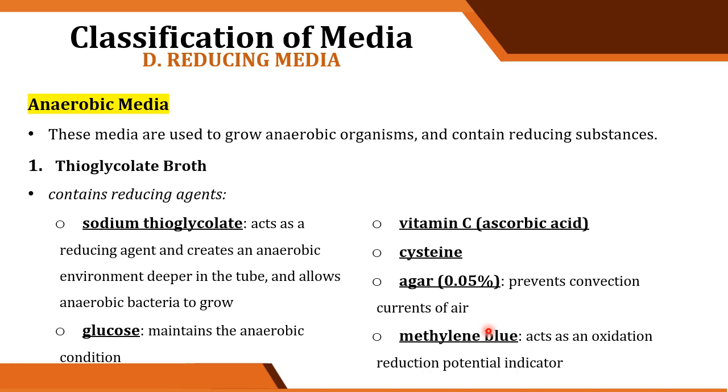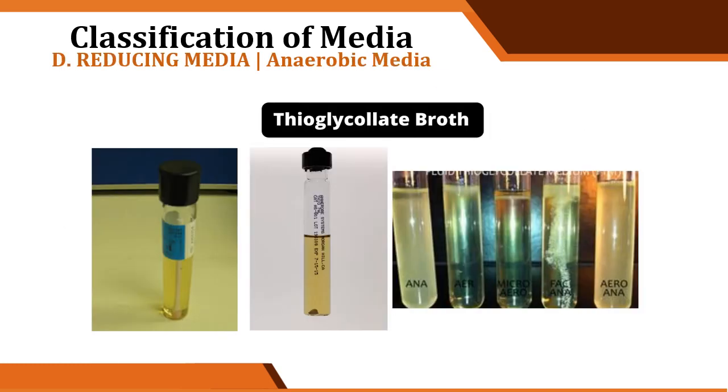Another example ng anaerobic media is cooked meat broth or RCM broth. Robertson's cooked meat broth. So, yung itsura ng thioglycolate broth.